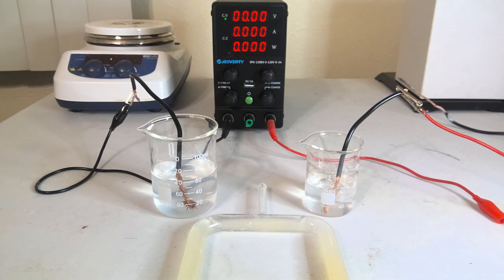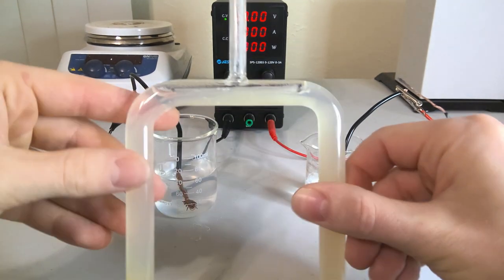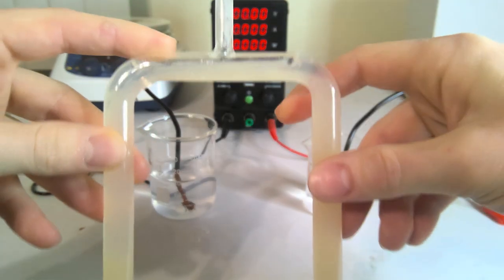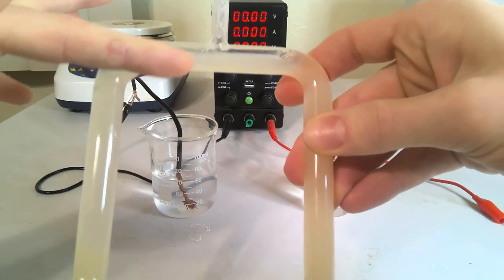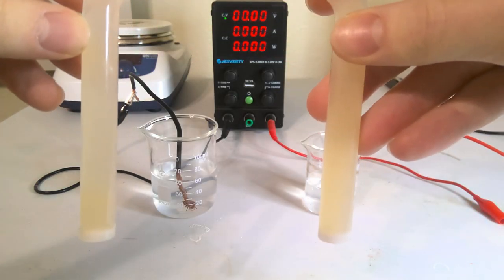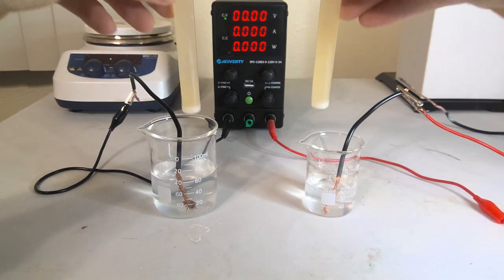Alright, we are back. Gave this sufficient time for the agar to set. Looks pretty good for the most part. Got a little bit of air bubble at the top, but still plenty of agar connecting throughout there, so it shouldn't be an issue.